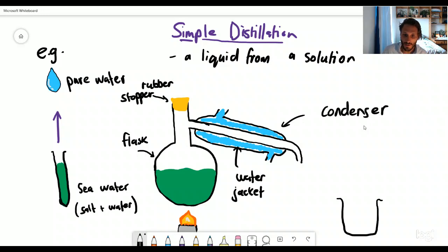And the water jacket continually has water flowing in through this inlet here. So water will go in through here. This can be from like a tap or any kind of water source. Water is going to go in. It's going to continually be flowing around this jacket, around this pipe. Water is going to be flowing around. And water will then flow out of here. Water out. And you're going to have a continuous stream surrounding this inner tube.